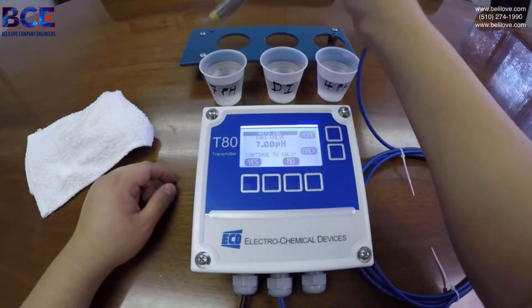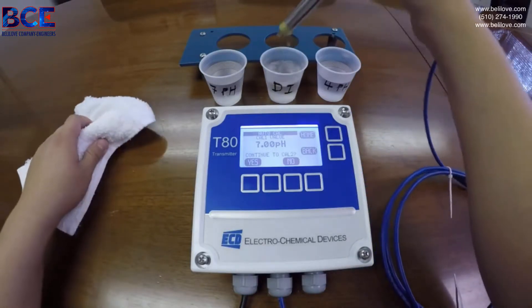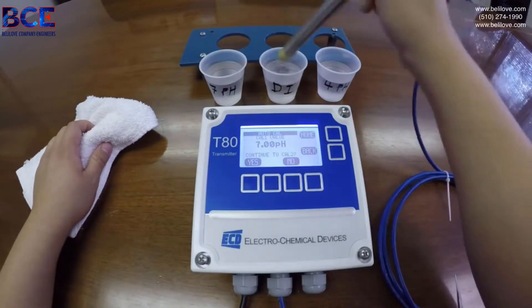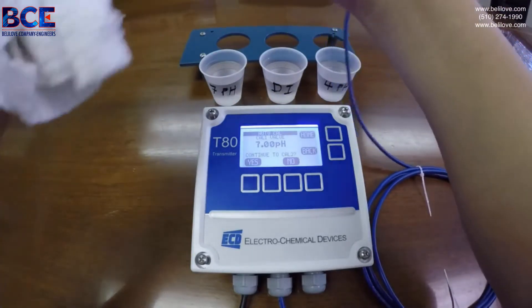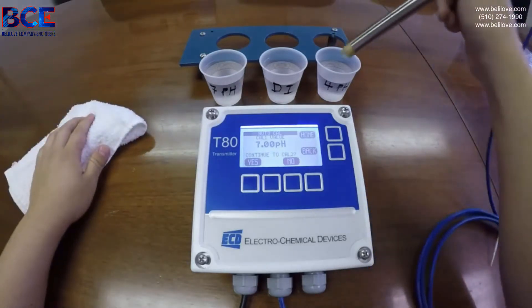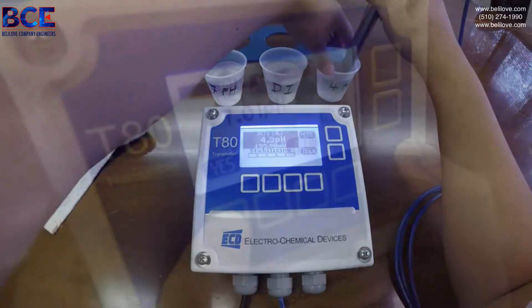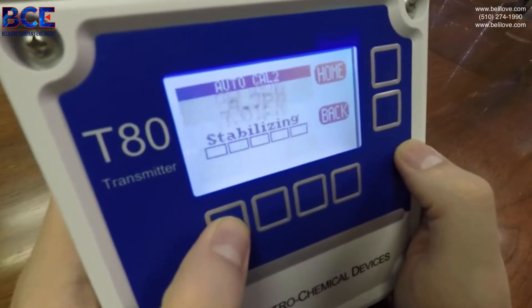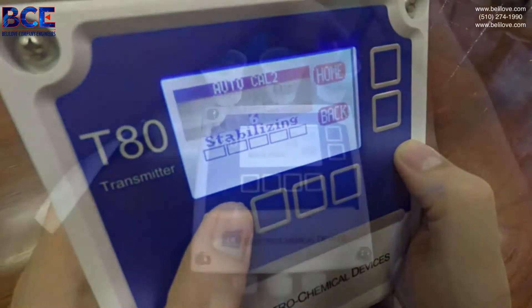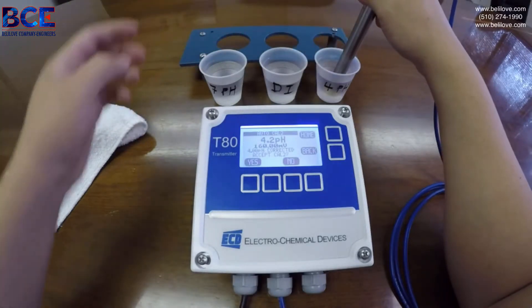The device will ask you to move on to cal 2, but before doing so, rinse off with DI water. Then enter into your 4 pH buffer and continue on, and accept the cal.